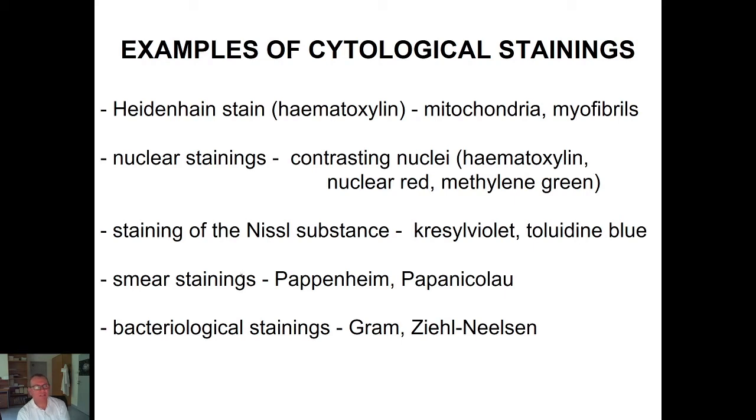And at the end there are some specimens from histochemical methods. Special staining is used in maybe 5 slides. I don't know it exactly now, and I will every time highlight the method which is used in our box.